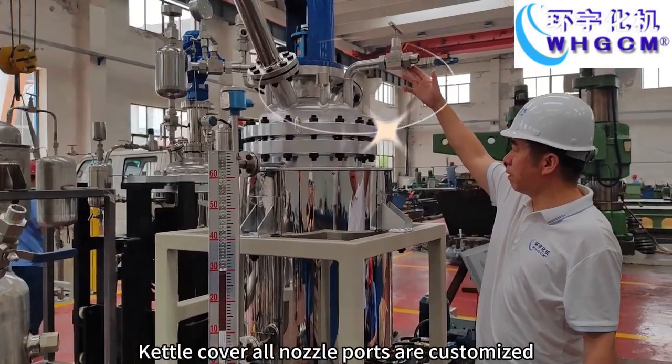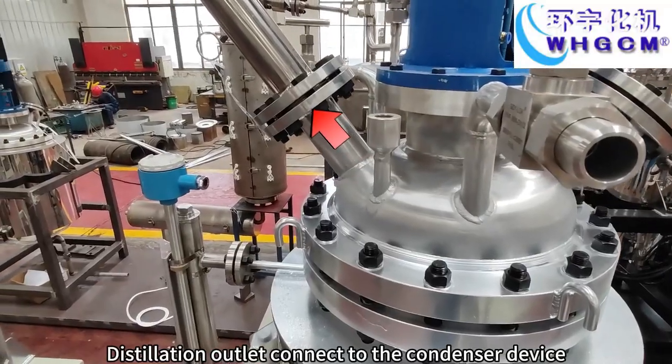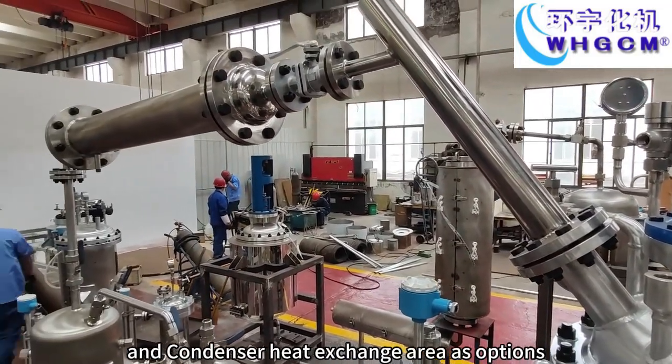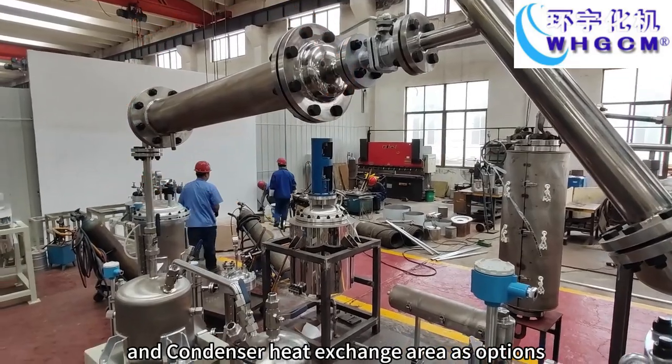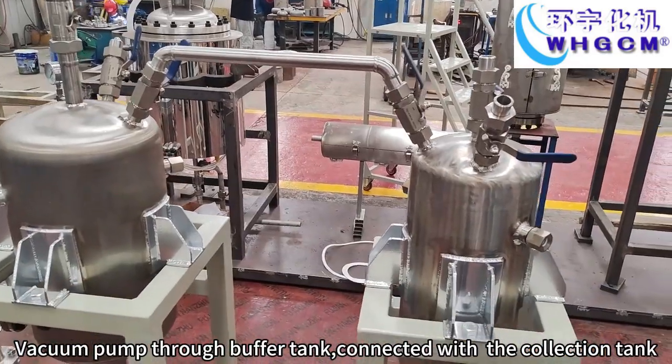Kettle cover nozzle ports are customized. Distillation outlet connects to the condenser device, and the condenser heat exchange area is available as options. Vacuum pump through buffer tank connected with the collection tank.